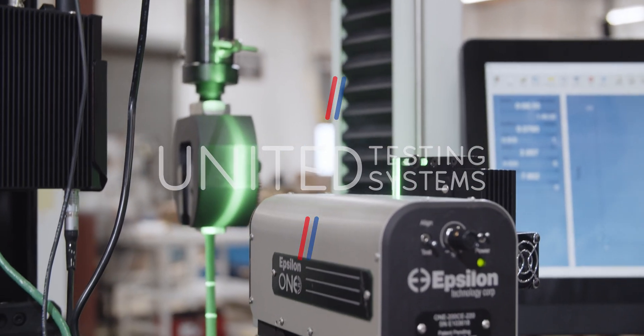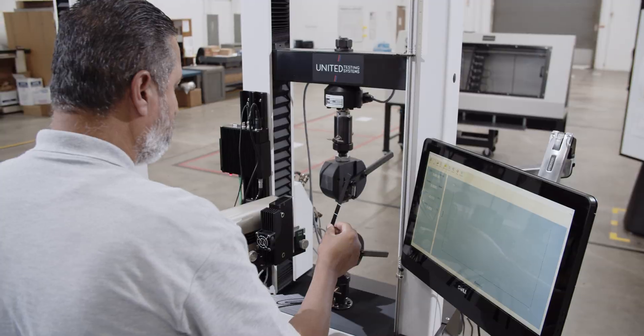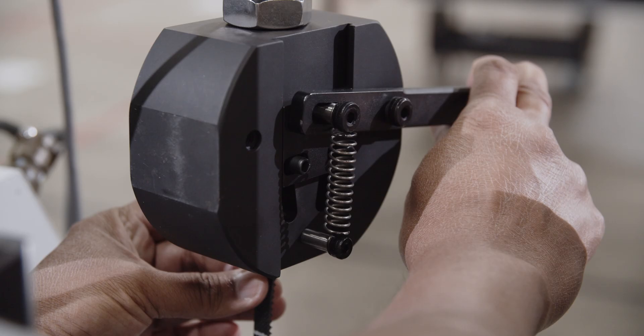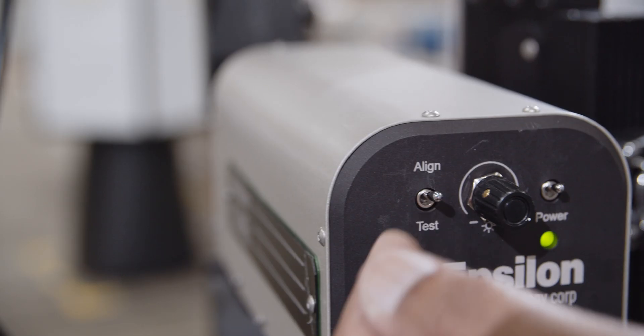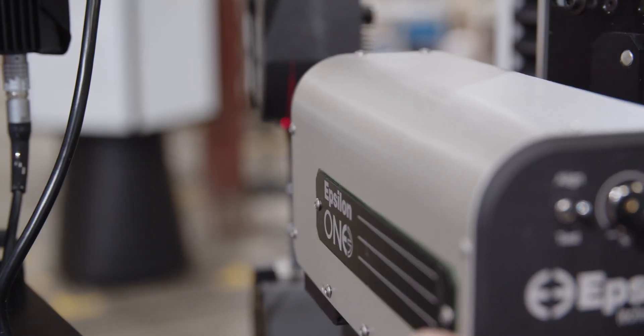United Testing Systems is pleased to offer the most advanced strain measurement system on the market today, the Epsilon 1 series of non-contacting optical extensometers.